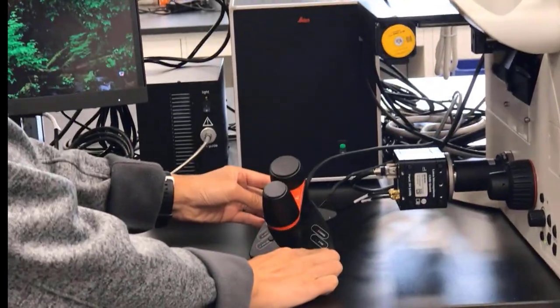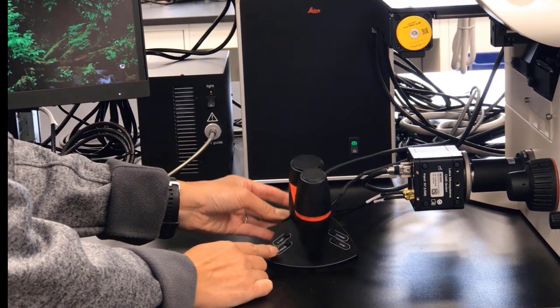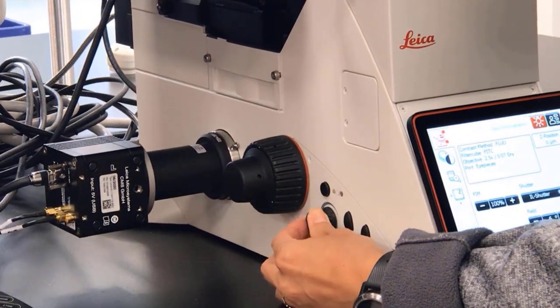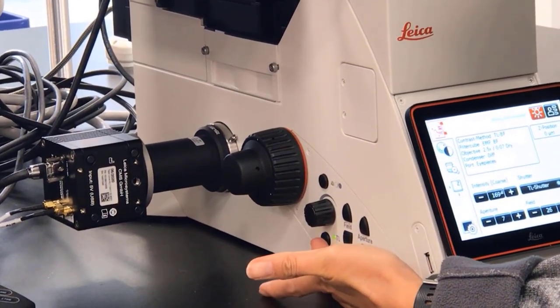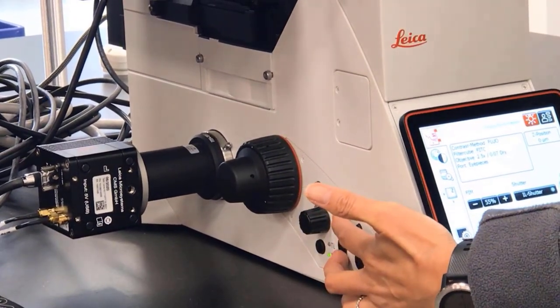On either side are buttons for the stage speed and the Z speed. On the left side of the microscope are controls for the light intensity, including shutter, light intensity knob, transmitted light and fluorescent light toggle, field diaphragm buttons, and an aperture diaphragm button.